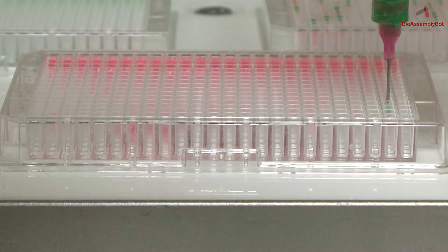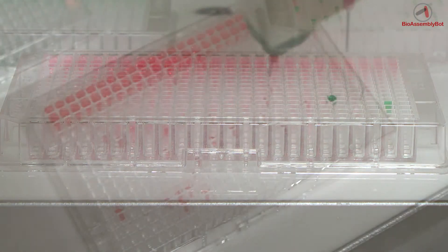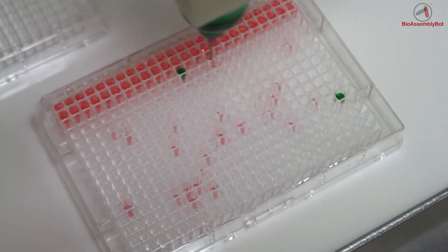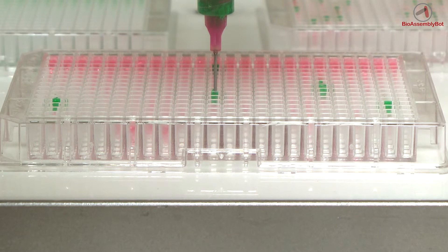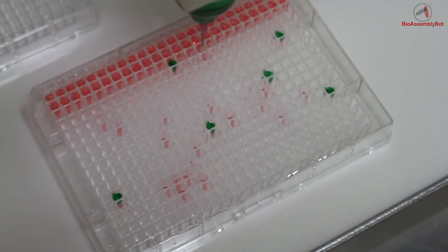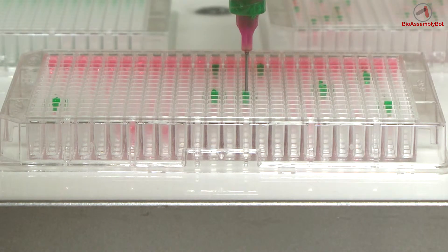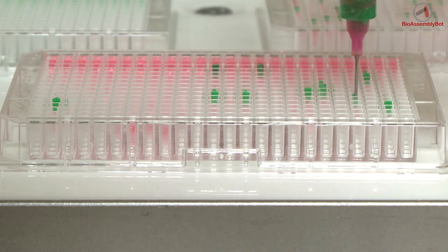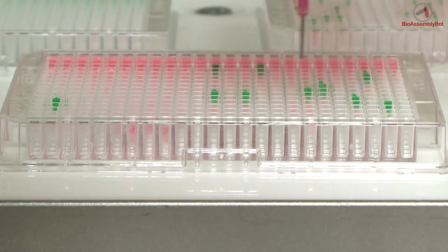Shown here in green is a similar task, only BAB has automatically changed into a new material with a new cell composition and a different needle size, to indicate that the system can automatically change material and/or cell material cartridges as well as needle diameter, and still maintain its precision and accuracy.